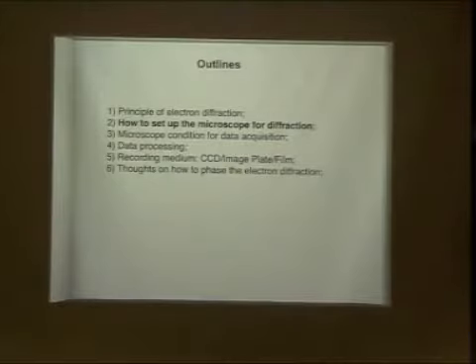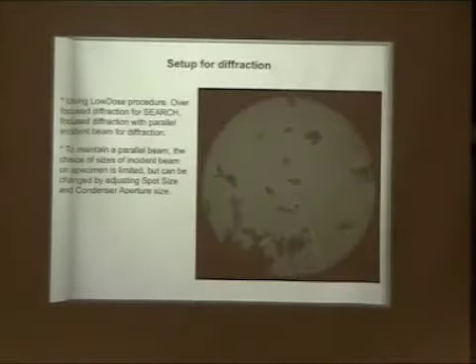Now the next thing we're going to see is how to set up the microscope and collect diffraction. Yesterday afternoon we went to a demo. I wasn't really familiar with the microscope setup, so I did not show it very well, and then other people demonstrated this principle very well. So basically, you still need to consider a number of things. You still need to use low dose. You still want to minimize your dose when you set up your microscope to record the diffraction.